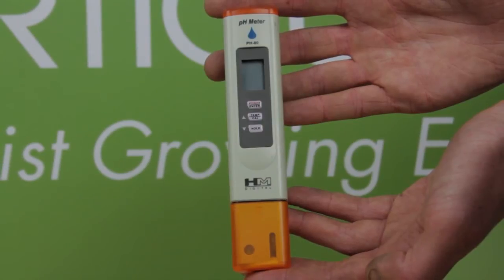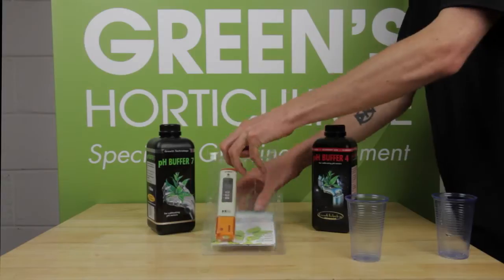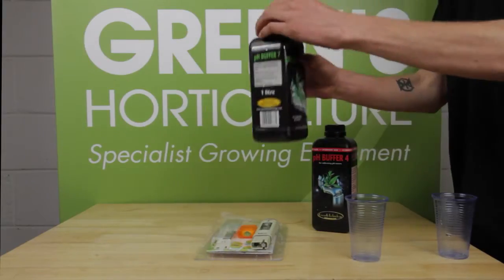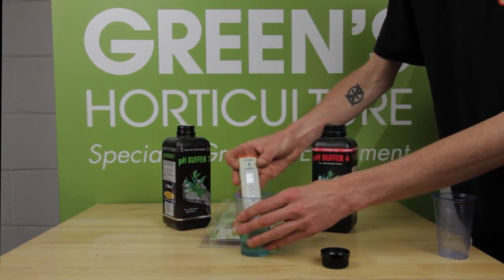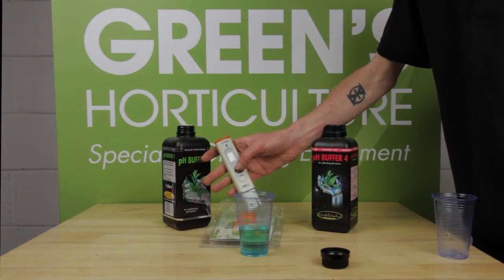We recommend that you calibrate your pen on purchase and then at least once a week during your growth cycle. If you're using it again after storing it for a while, you should also recalibrate before use. Regular accurate pH readings are vital to successful growing with any hydro or coco system.